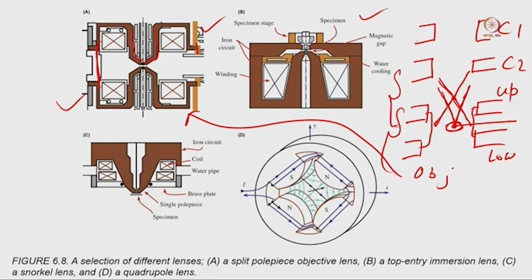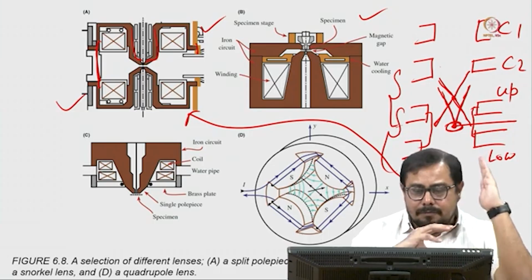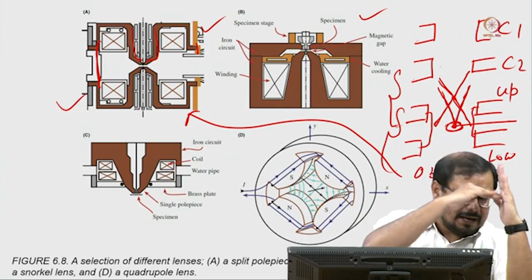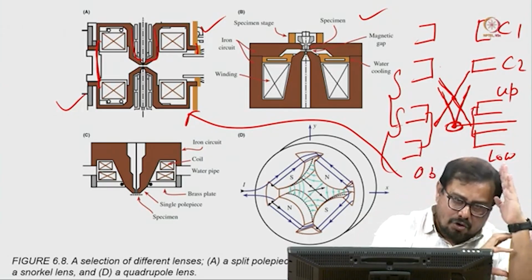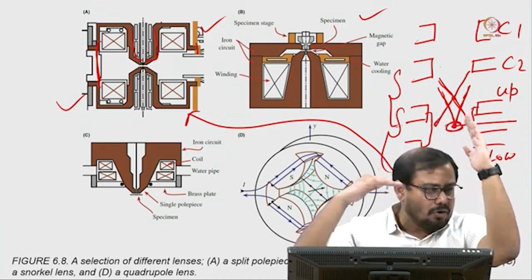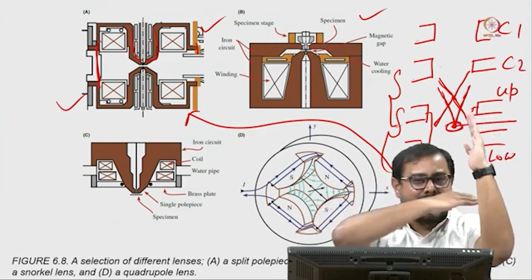It is not very frequently used nowadays. There are two different types of microscope available. One is the top loader microscope, meaning you load your sample from the top of the microscope. And most of the recent microscopes use a side entry holder. If you remember the microscope column, starting from the gun, then condenser 1, condenser 2, and then there is a goniometer or stage, where you insert your holder. So this is the side entry holder.